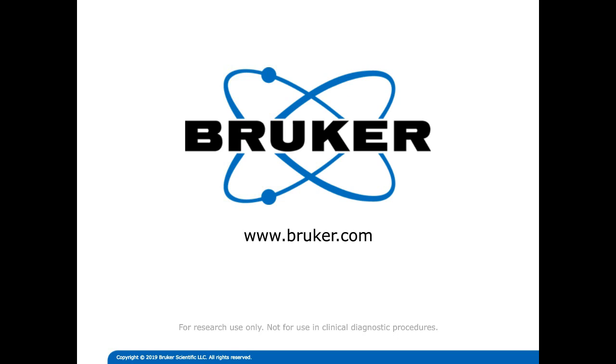Another question that came in asks, are there any special sample preparations necessary to ensure that an oligonucleotide sample has stability? This would really depend on the sample prep for whether it is a MALDI or an electrospray instrument that we're looking at. But as far as stability goes, it would really depend on what instrument, what platform you would be using.